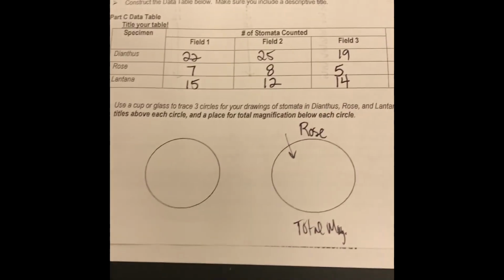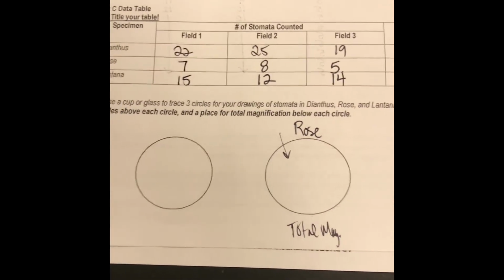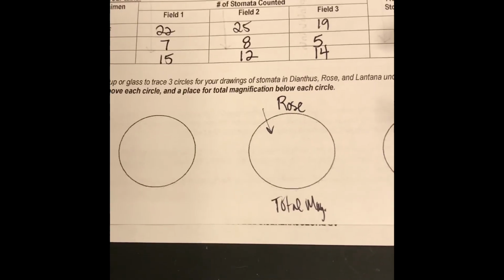All right, here's the last one, guys. This is dianthus. This one's a good one. Remember, push pause so that you can get a snapshot. There you go. Okay, and your numbers for dianthus are right here. Field of view 1, 2, and 3.